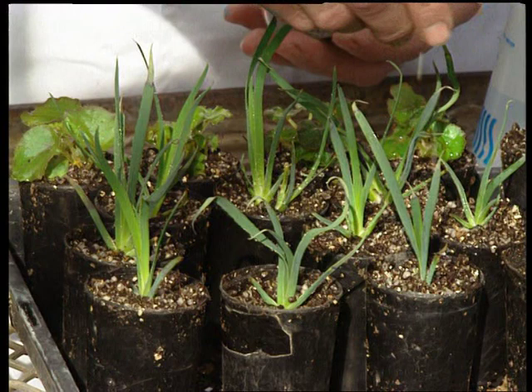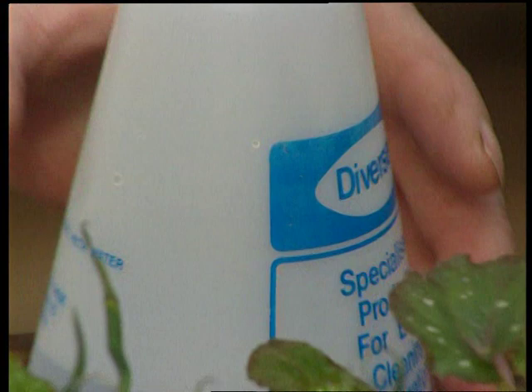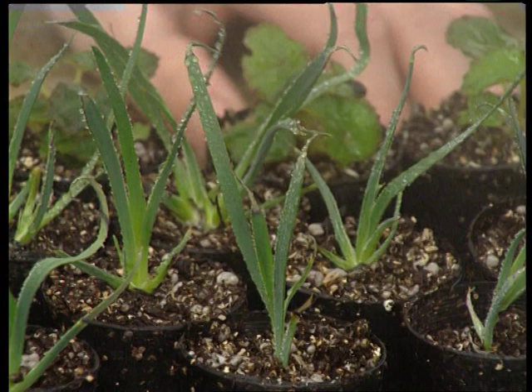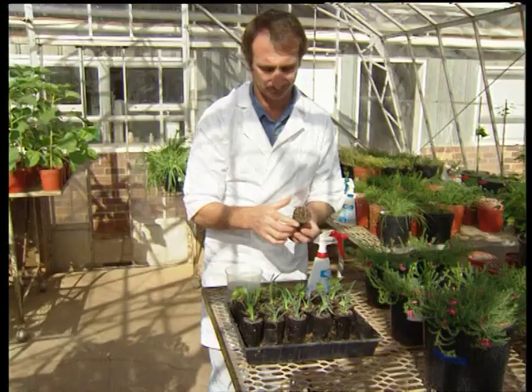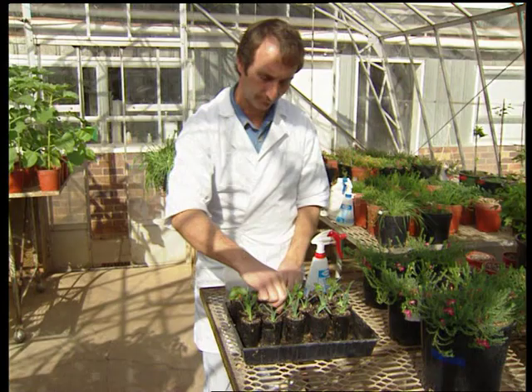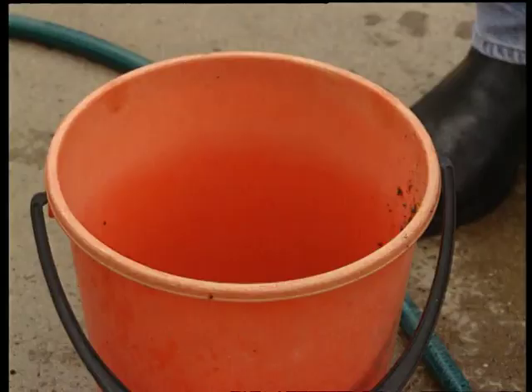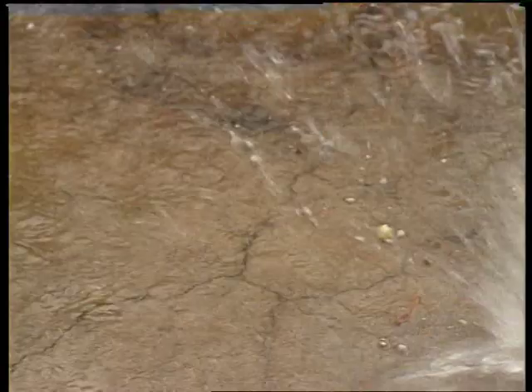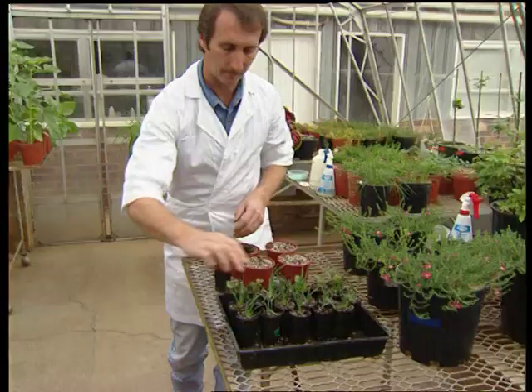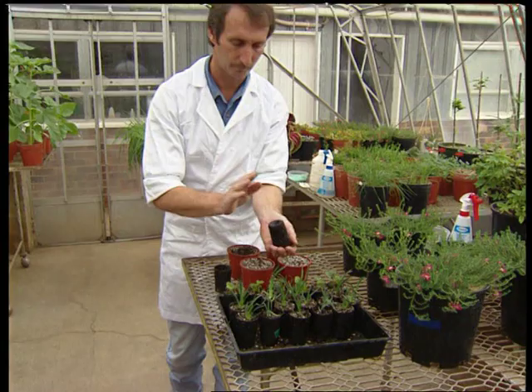Dilute liquid fertilizers, such as Aquasol, could also be included on a weekly or fortnightly basis. The length of time taken to acclimatize plants varies depending on species, but generally it takes between 4 to 6 weeks. Although at this stage the plants are grown under non-sterile conditions, hygiene is still very important. Diseased plants must be eliminated quickly and the area washed with a suitable disinfectant. The acclimatized plants are later transferred to larger pots or to the field as required.